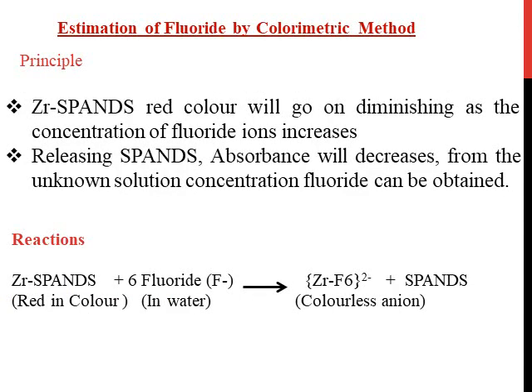Next is estimation of fluoride by colorimetric method. You have not done the colorimetric method. What is the principle of estimation of fluoride by colorimetric method?